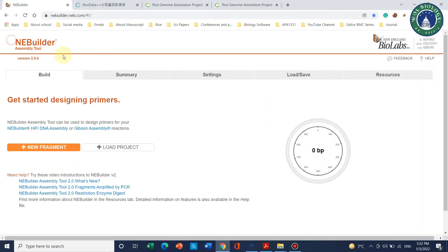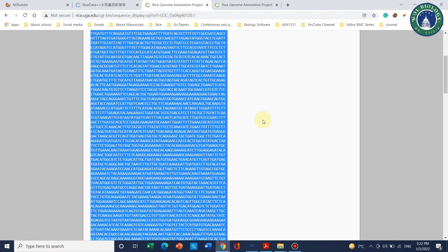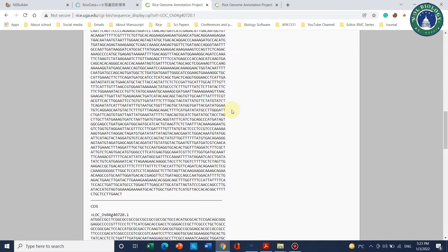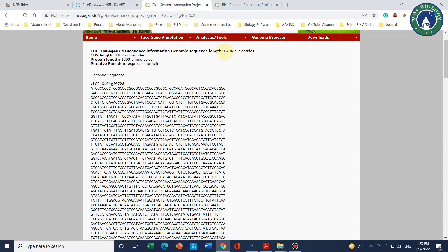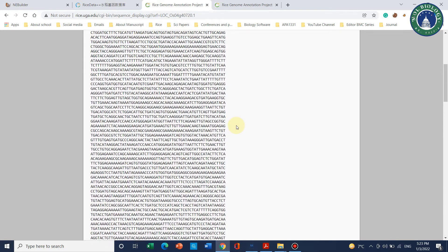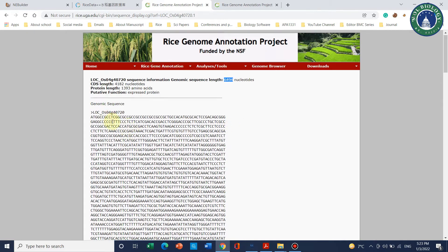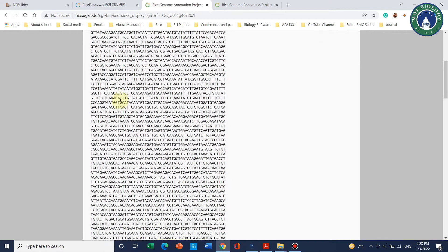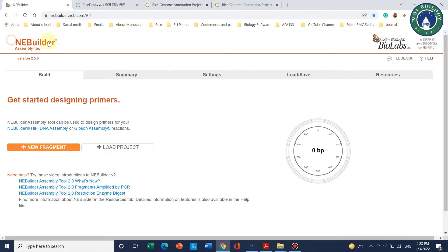Welcome to another video tutorial. In this video we will be using an online tool called NEB Builder assembly tool. With the help of this tool we can design primers for a gene that is usually longer than normal. For example, this gene has an overall length of 6494 base pairs, so it may be hard to clone it in one cloning reaction or one PCR reaction.